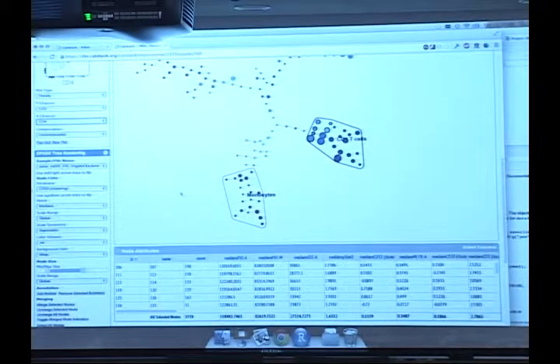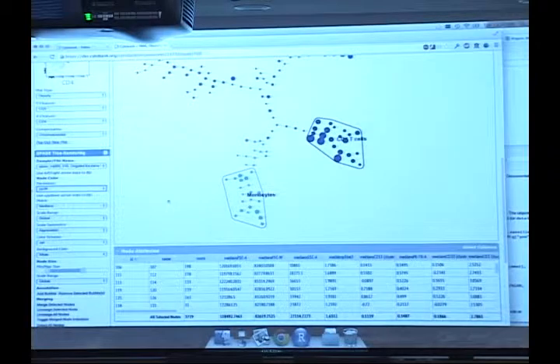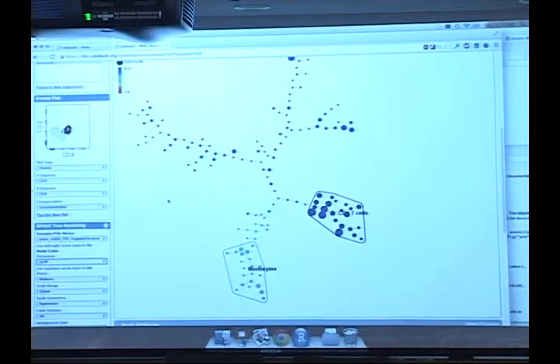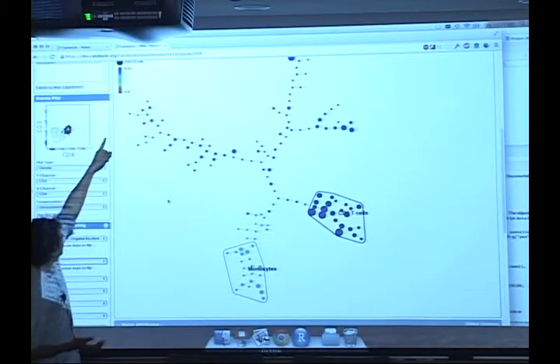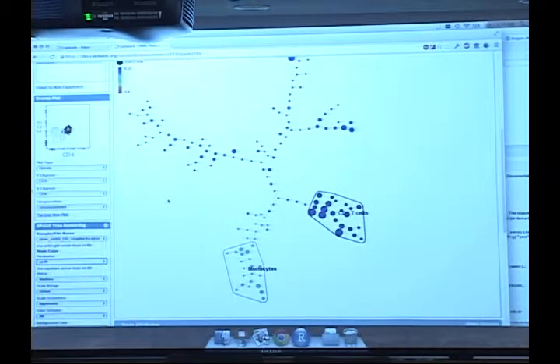Now we might want to see what these guys are doing. So let's start coloring by some of our functional markers. We can color by phospho-P38. In our unstimulated state, phospho-P38 isn't doing much. Red, according to our scale here, is high, but we don't really see a lot of red on the board. So instead of just looking at the mean, let's look at the fold change. And this is where we bring in our fold change versus our baseline condition.